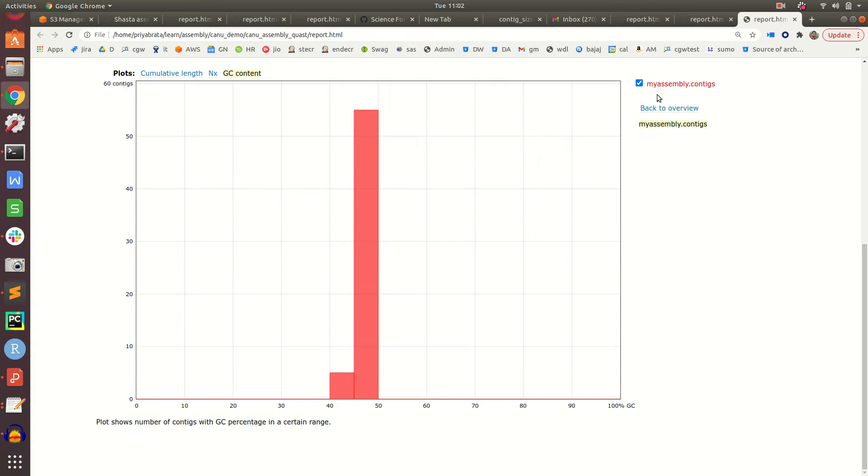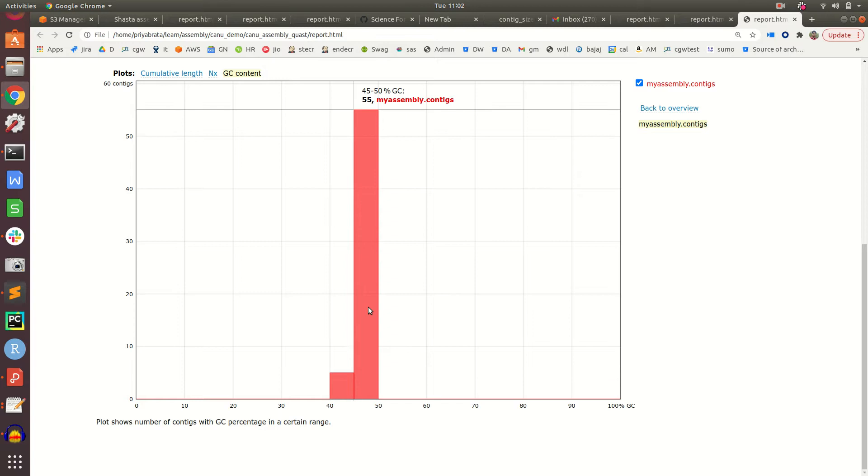The GC content looks normal but there are some higher and lower GC content regions. We can analyze by contigs - the majority (55%) are between 45-50% GC content.